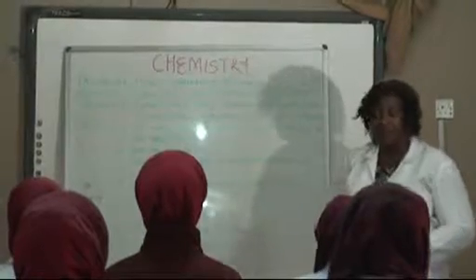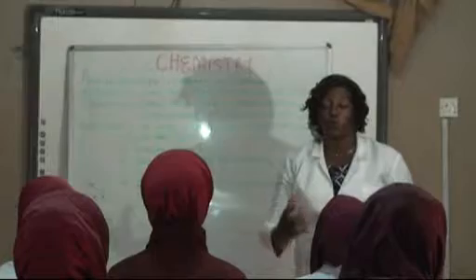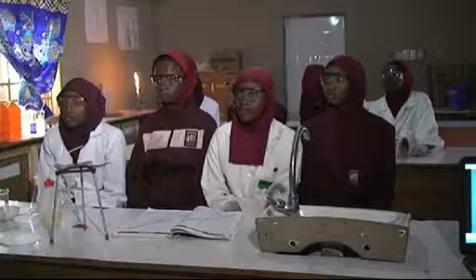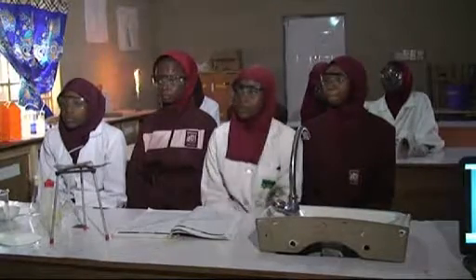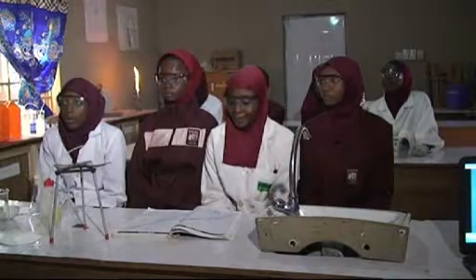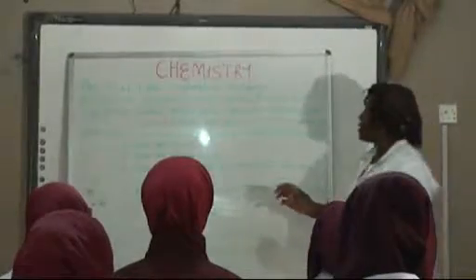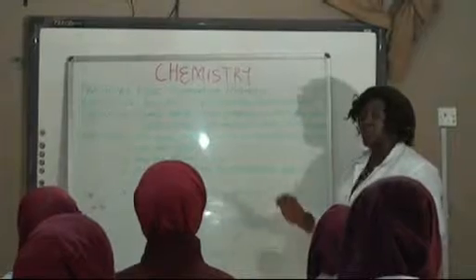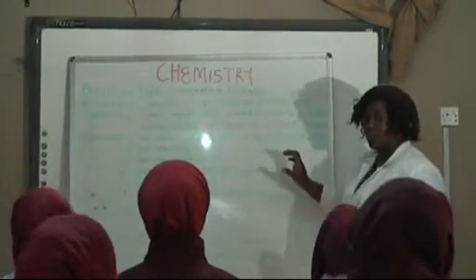Assuming you went to the market and on your way back you have bought the salt that you're going to use for cooking, and mistakenly the salt fell on the floor and then mixes up with the sand. Does it mean that the salt is not recoverable? No. You can recover back your salt again by this separation technique. What we are going to do now is to show you how to get back your salt and separate it away from the sand using this method, filtration and evaporation.